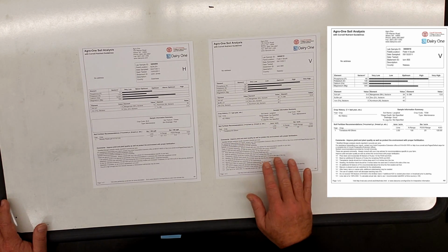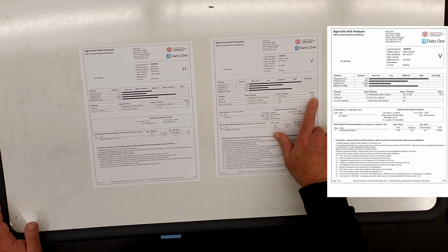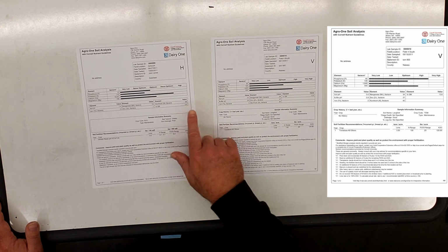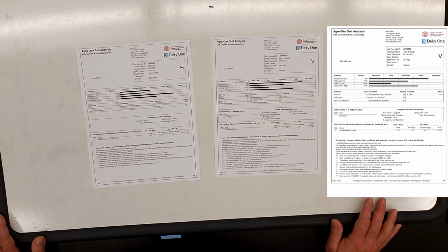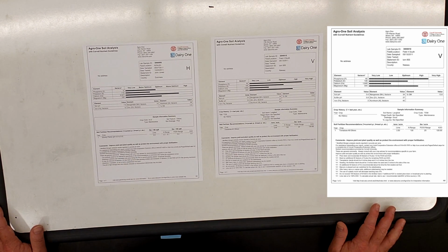but these numbers are well below that, so not something that we really should be worrying about. The last number here is percent organic matter, and you notice that in the homeowners we're looking at 2.9, but in the vegetable one we're looking at 13.8. 13.8 is a fairly high number for a field crop. It makes me think that they're probably spreading manure or something like that.